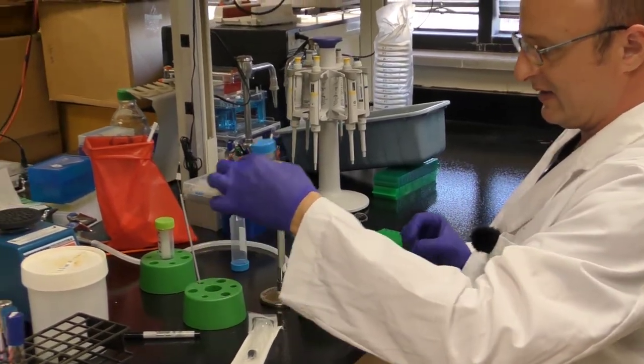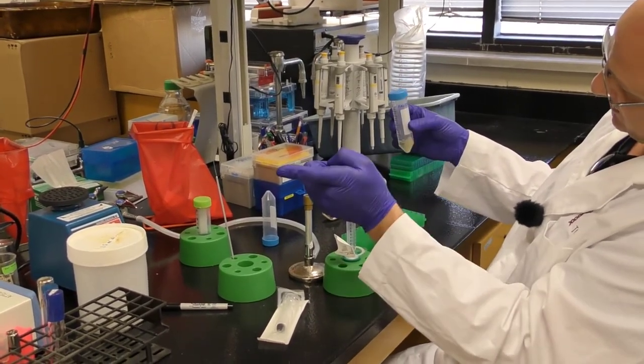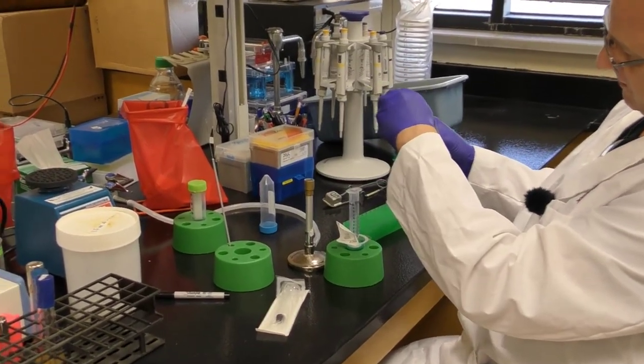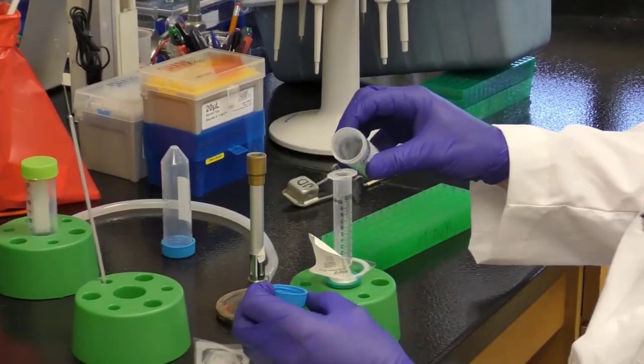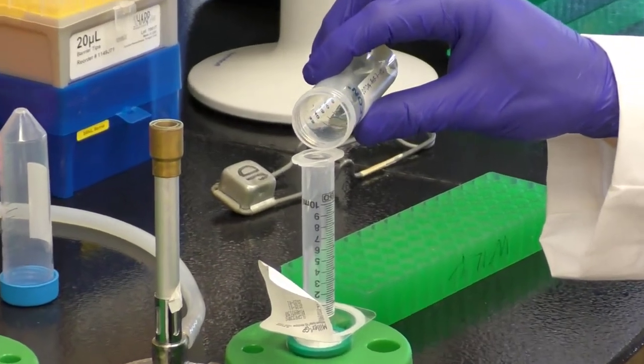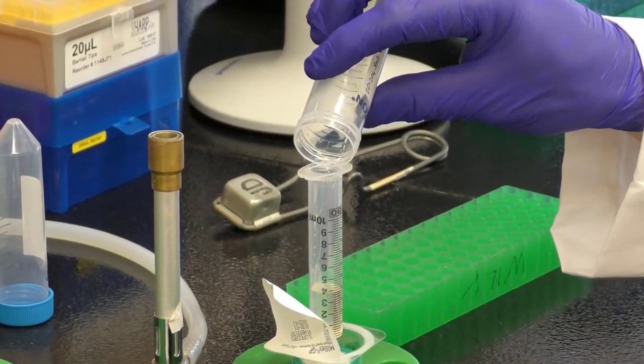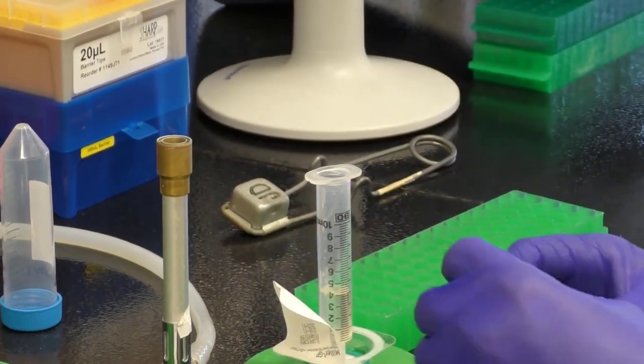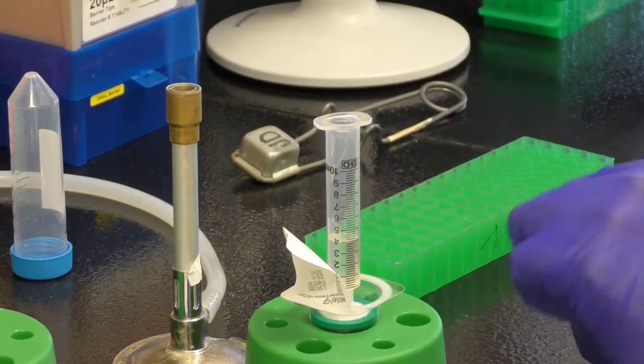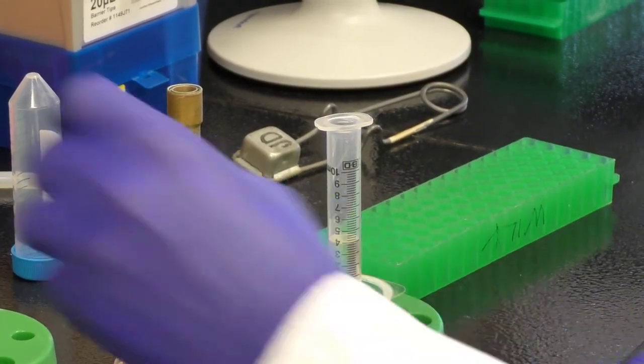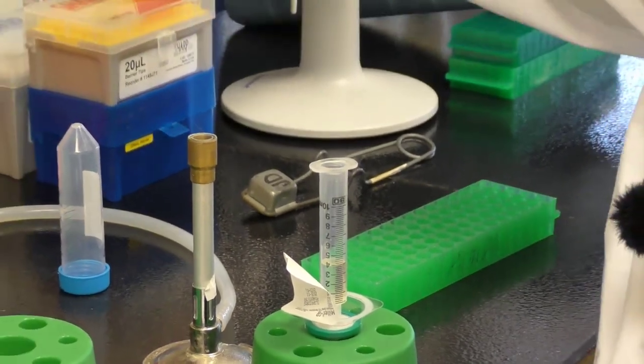And then carefully pellets this side, liquid fractions this side. So I'm going to pour this way. And we just pour liquid fraction. There'll be a little bit of cell debris, maybe a little bit of the top agar that goes in there. So we may have to use more than one filter, but that's not a problem. This is now useless and we get rid of it.